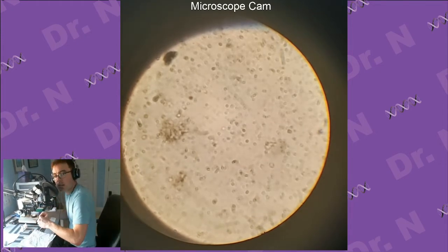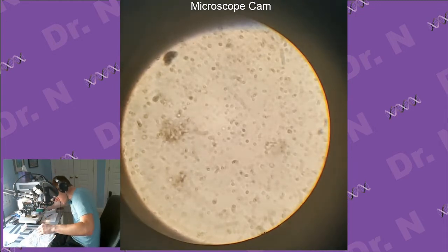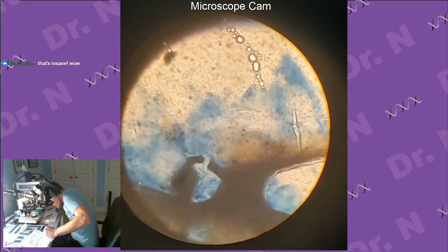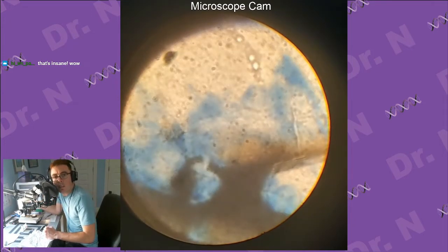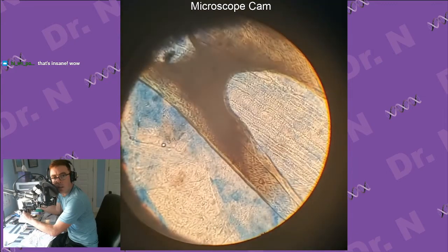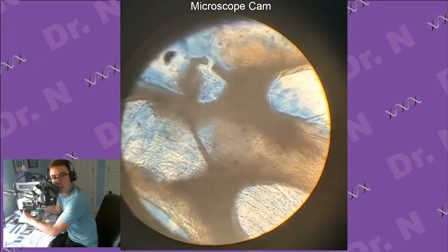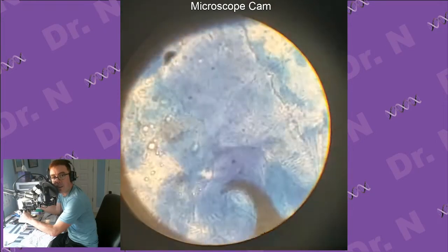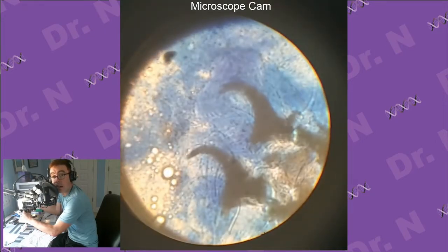Gotta clean up the top of my slide first. There we go. All right. Well, we're seeing high magnification of these mouth hooks. There they are. So this little bit right here, I didn't plan to have these on here, but they're fun to look at. This little bit right here, that's what's actually coming out of the mouth of the larvae.